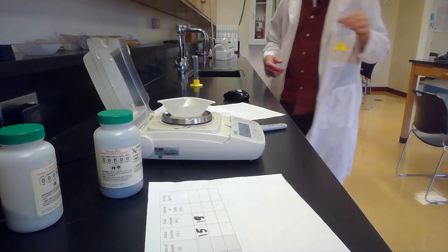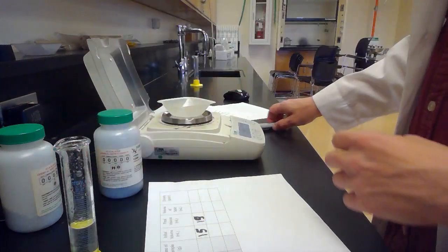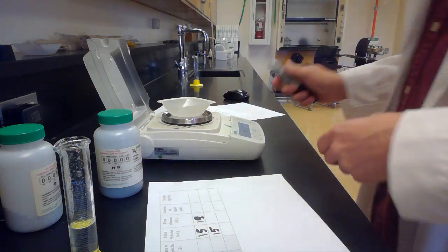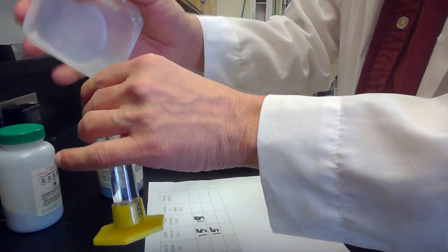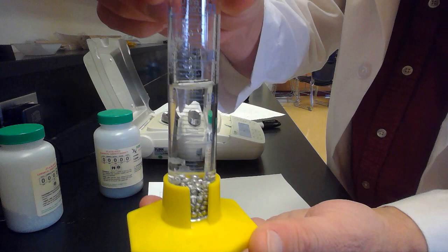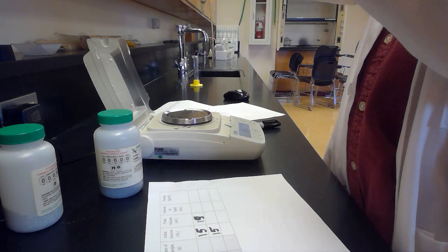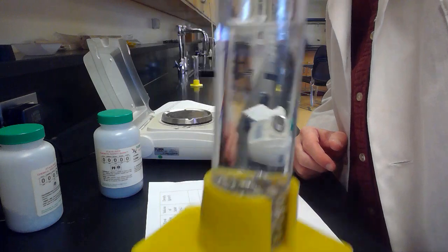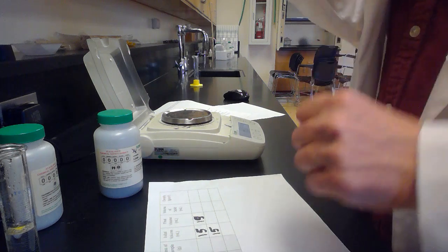Yeah, that's really good. Okay. So we're at about 15 milliliters, and that is the initial volume. I'll put it in the right spot this time. And then I'll put my tin in there. And now you can see the water level's gone up. It's now at 15, 16, right about 17 milliliters. I don't know if you can see it in the camera. It's right about 17 milliliters. So we'll put that for the final volume.